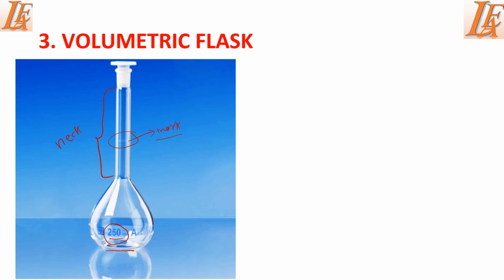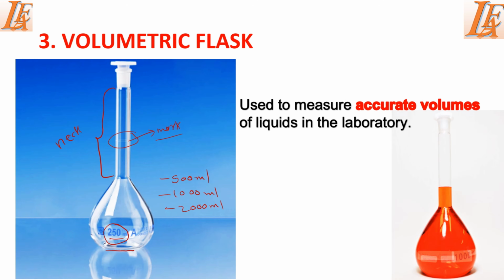We have other volumetric flasks with different capacities, like a 500 ml volumetric flask, a 1000 ml volumetric flask, and also a 2000 ml volumetric flask. Now the function of this volumetric flask is to measure accurate and fixed volumes of liquids in the laboratory.